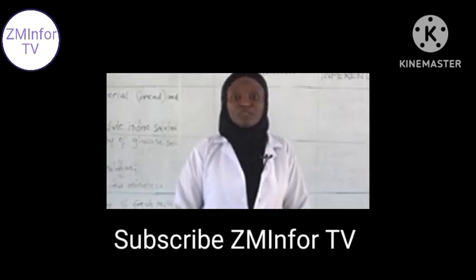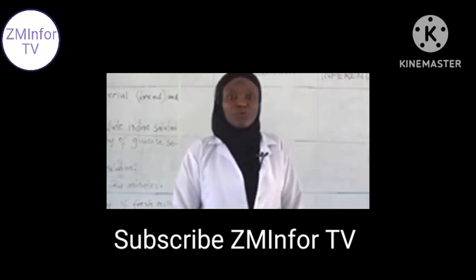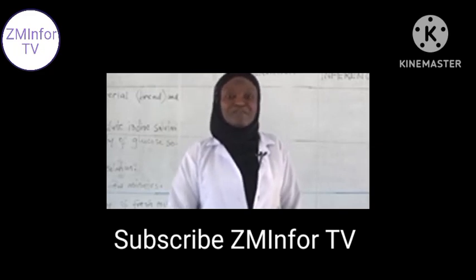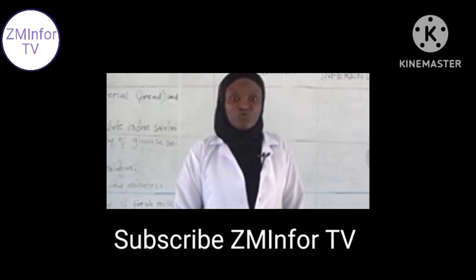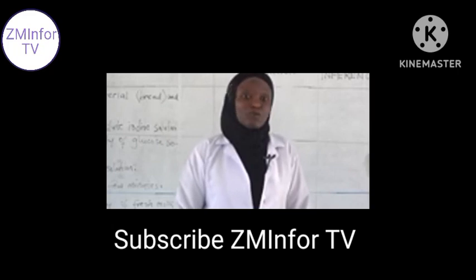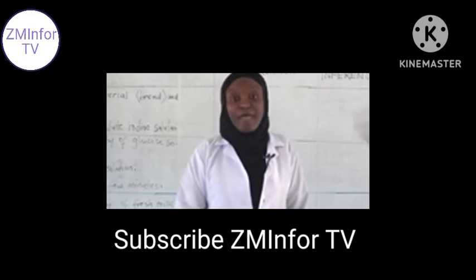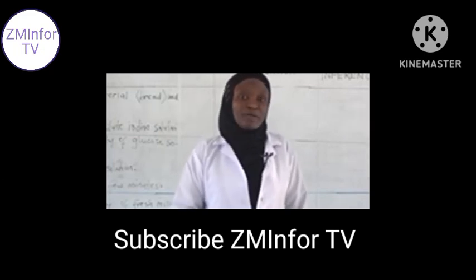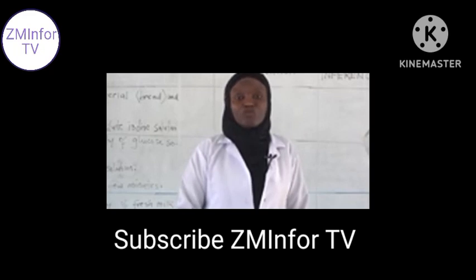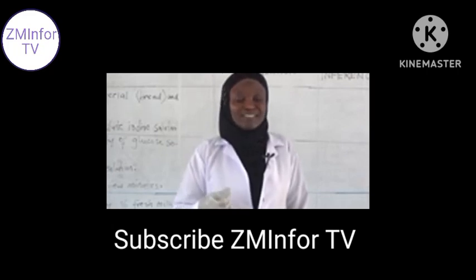First, you start with observation. For anything you are given in the lab, you require your senses to observe first. You need to observe very carefully. Look through. By looking, that is the observation or examination, you may require the use of a microscope or hand lens to magnify your view, where the specimen provided are of minute or small size.